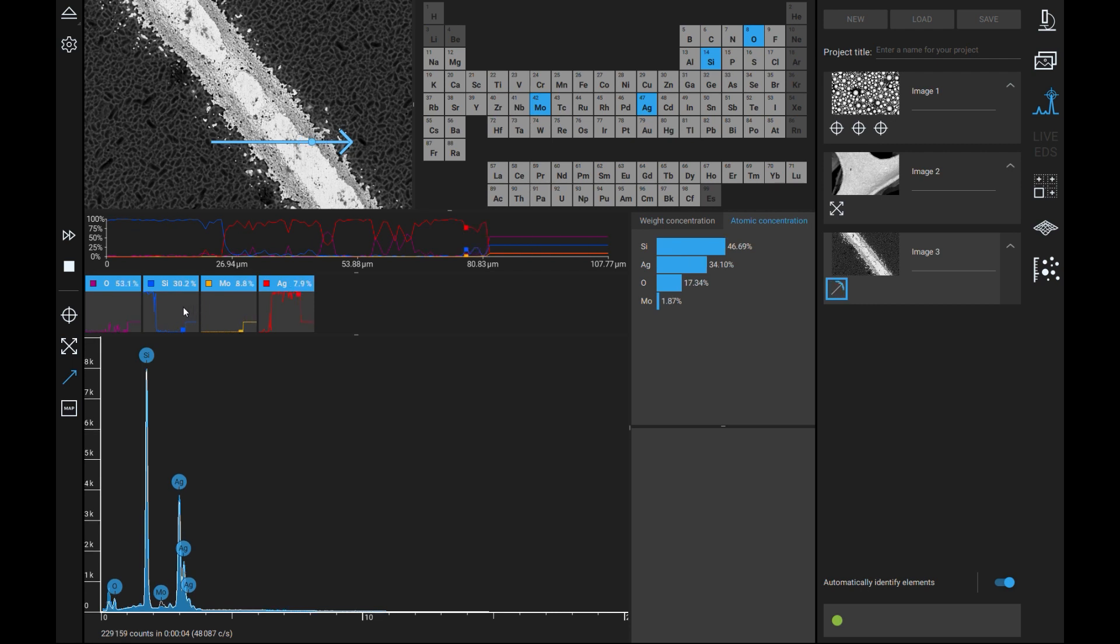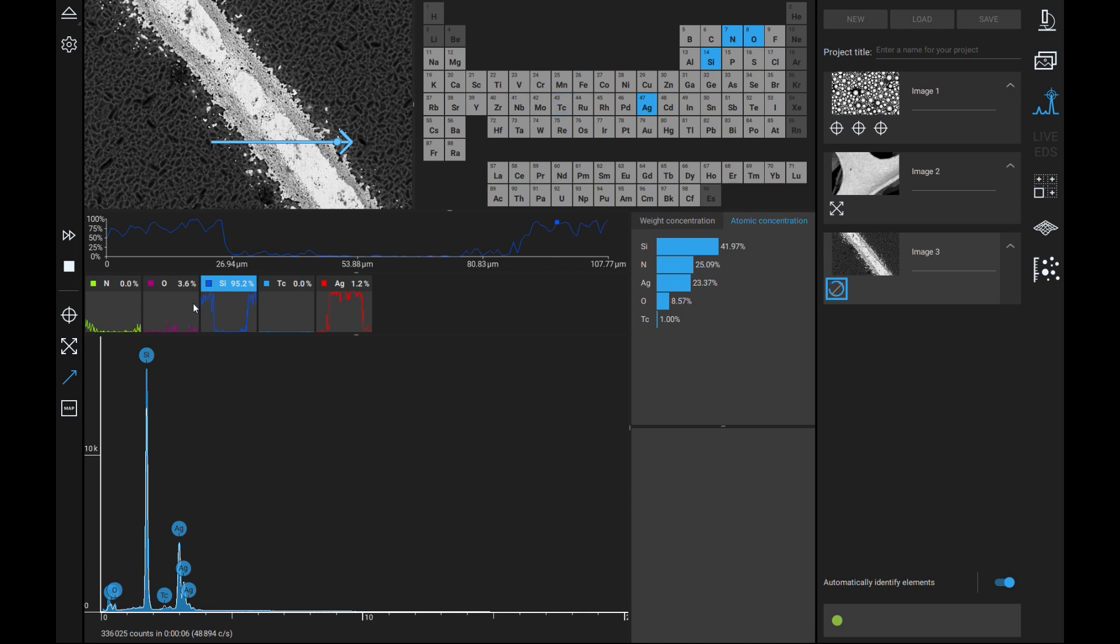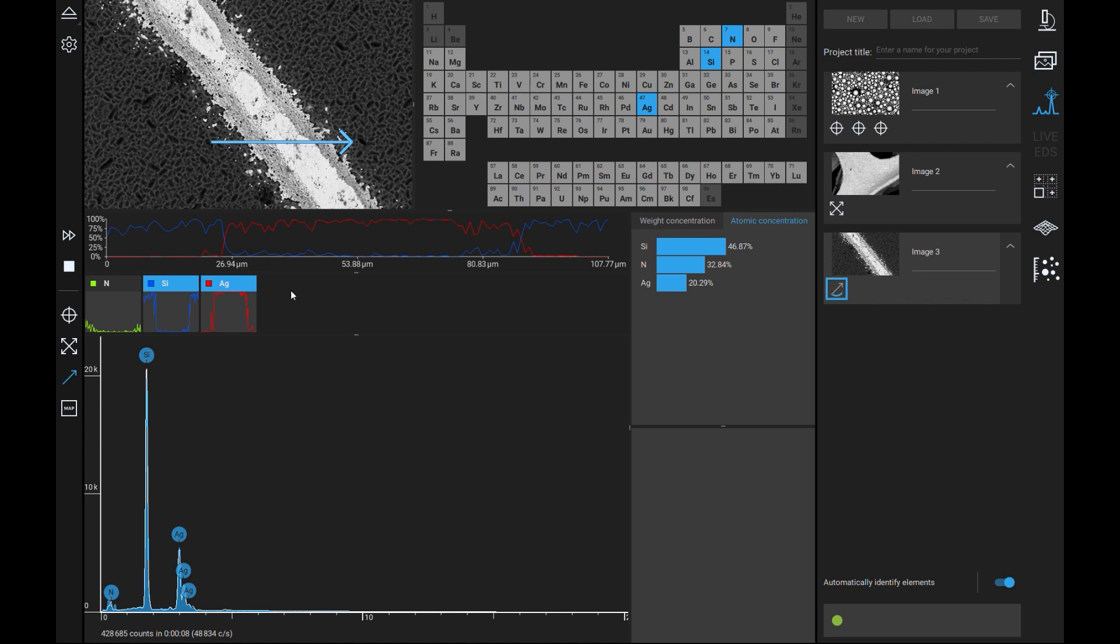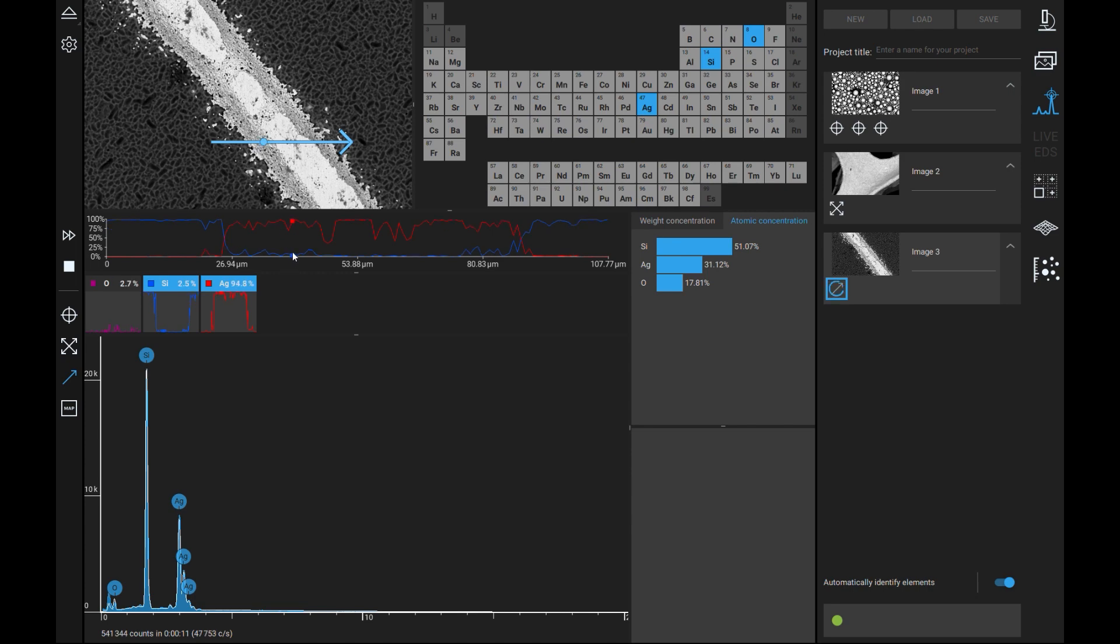The line graphs generated can be viewed individually by left clicking or multiple at a time by holding control and left clicking. The software will also show where along that line a specific ratio was acquired by hovering the mouse over the line graphs.